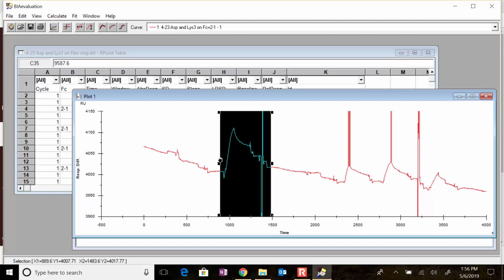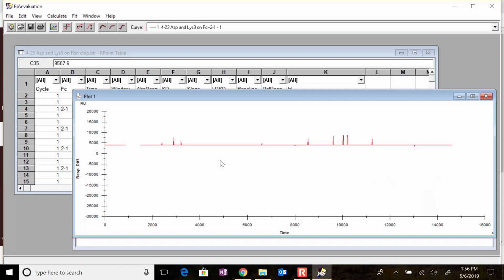I can resize the line. And I right select, scan over, and now I have the data that I want, and I'm going to just Control X. And you see it zoomed out, because it always zooms out when you give it an excuse to. But now, it's missing. Okay, we've cut it and put it in the clipboard.